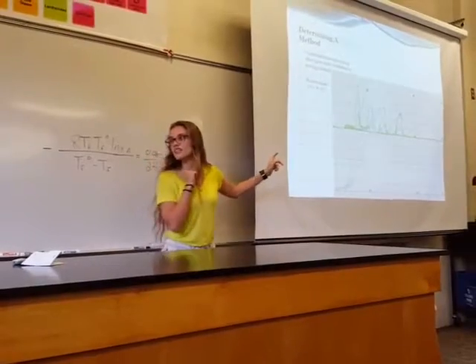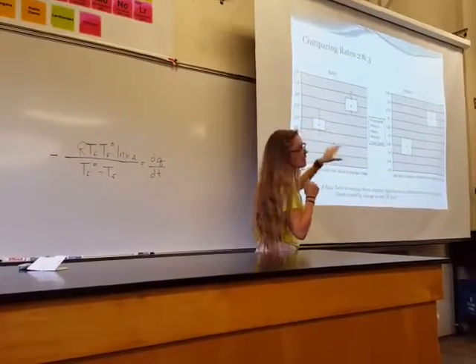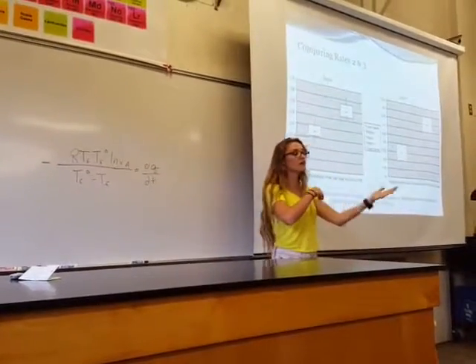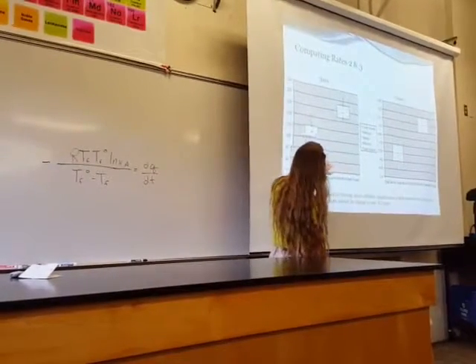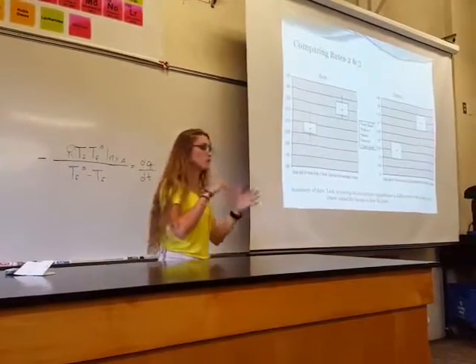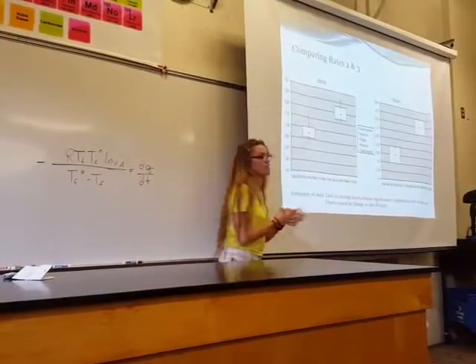So these were also the same graphs, but for melting curves instead. And so we can see that even for melting after supercooling, there was this significant difference in onset and a little bit in area between the curves, between rate 2 on the right and rate 3 on the left again.